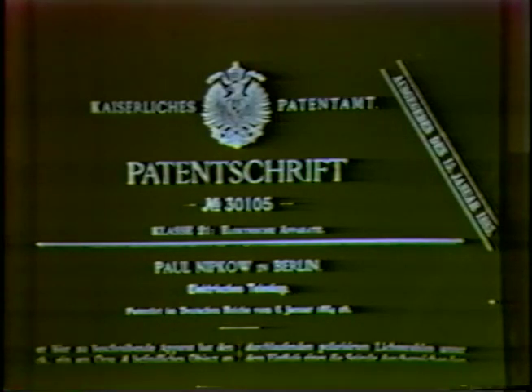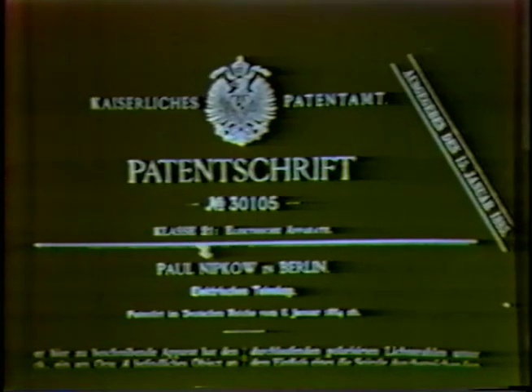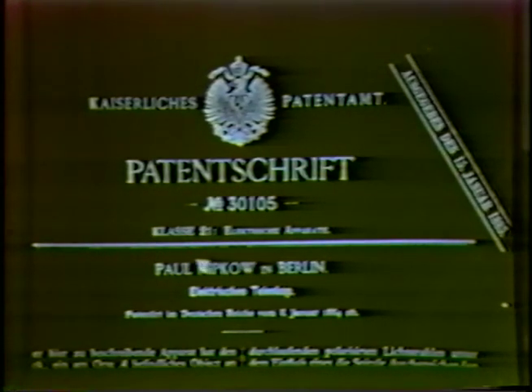And I think there are two interesting things here that I'd like to mention to you as a diversion. Petran and Hadravsky attribute the design of their aperture disk to Nipkow, who took out his patent in 1884. That's 104 years ago now. In fact, they're very generous in assigning it to Nipkow because their development of the Nipkow disk is an extreme development of the original idea.